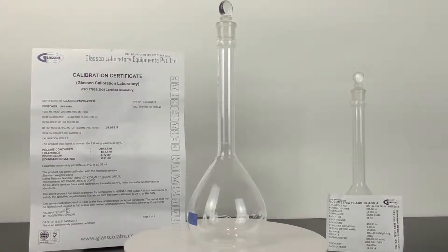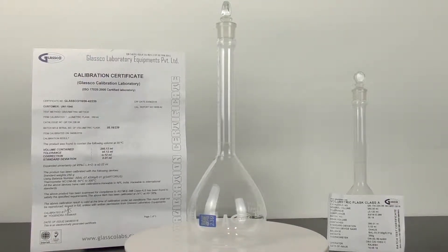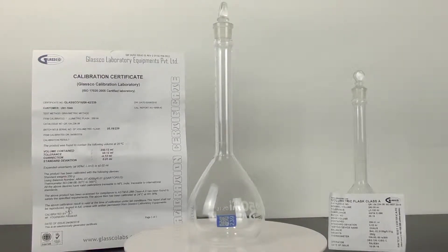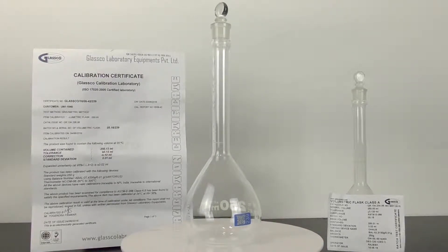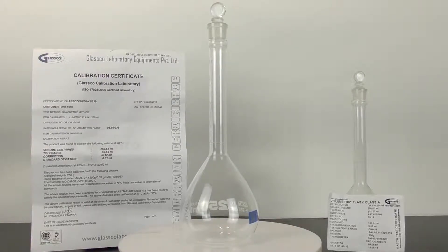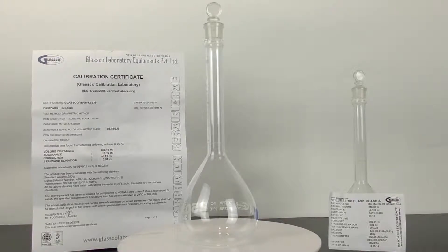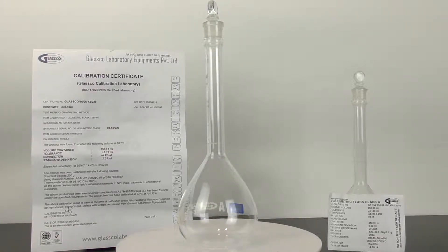Having reliable and accurate glassware for your lab is necessary for today's modern labs. The certificate that comes with these Class A items assures you have a well-calibrated product, but chasing down the paperwork for your certifications should not interrupt your workday. These volumetric flasks have QR codes labeled clearly on the side, so your certification is never more than a smartphone app away.